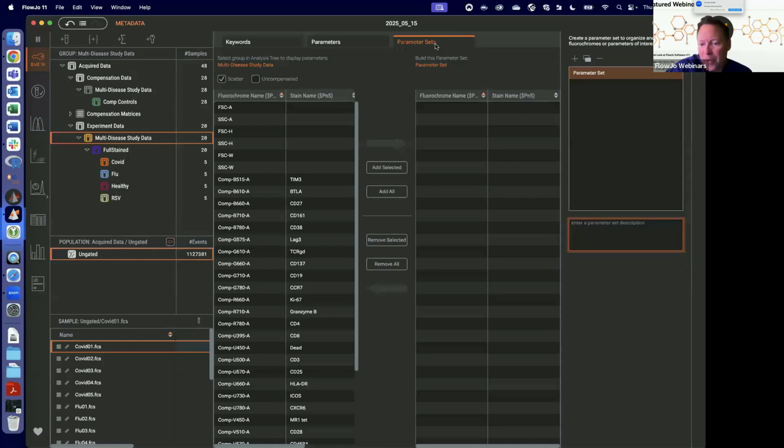Question from Natalie, which actually sort of ties in here as well. Will we need to use a separate plugin to see S8 images? No, actually we have an image viewer built in. And I will at the end just dump some image data in to show off the tools for imaging.